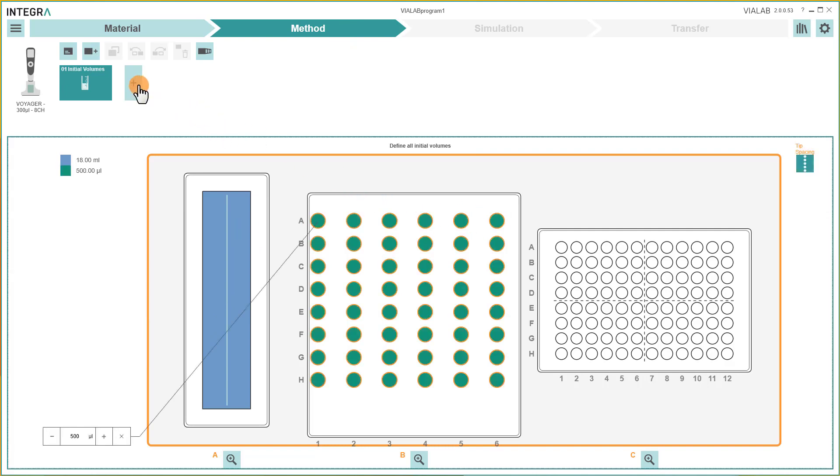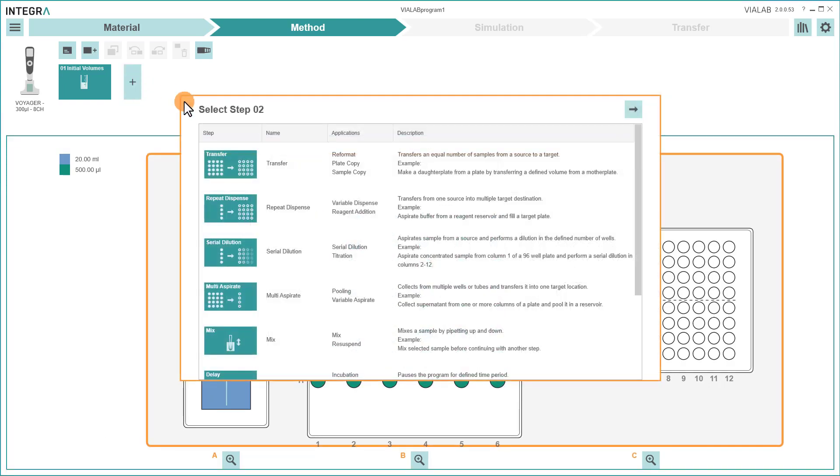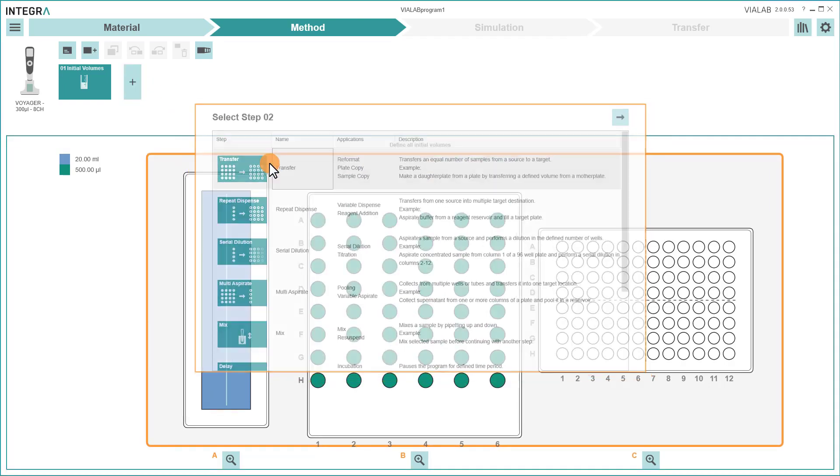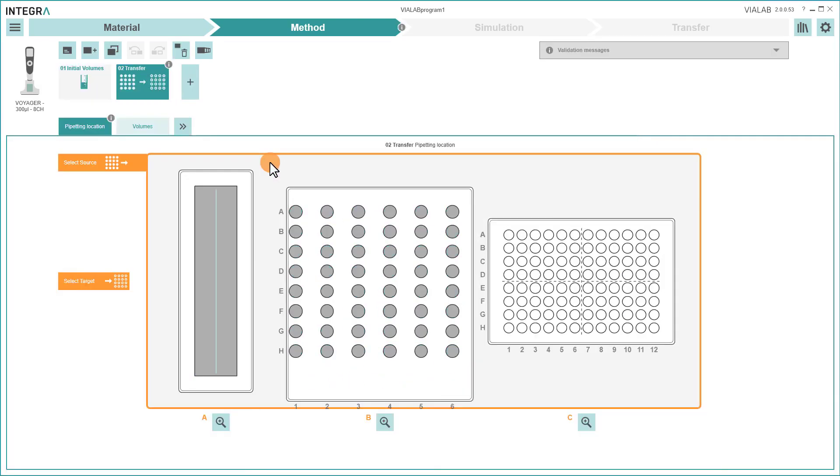With the plus symbol, you can add different pipetting steps. After choosing a step, define source and target locations.